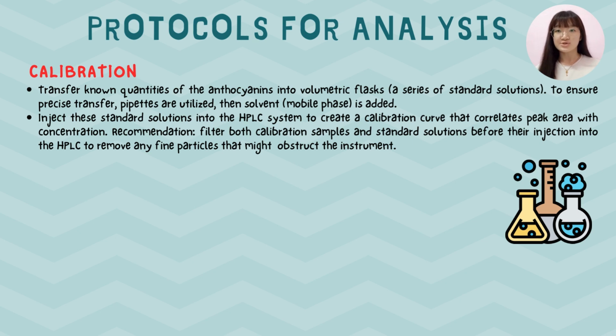Then, inject these standard solutions into the HPLC system to create a calibration curve that correlates peak area with concentration. It is recommended to filter both the calibration sample and standard solution before their injection into the HPLC to remove any fine particles that might obstruct the instrument.